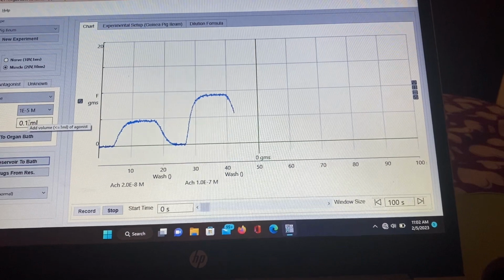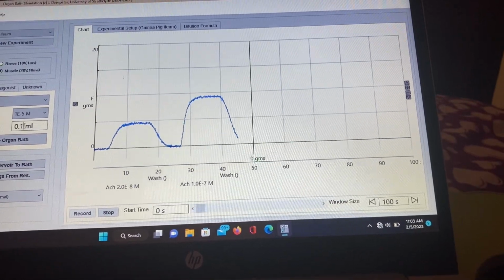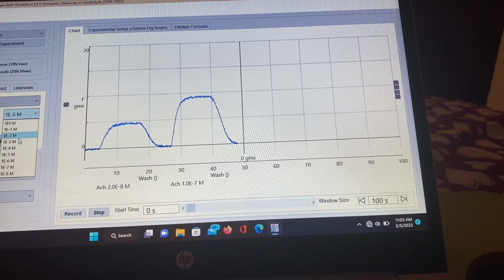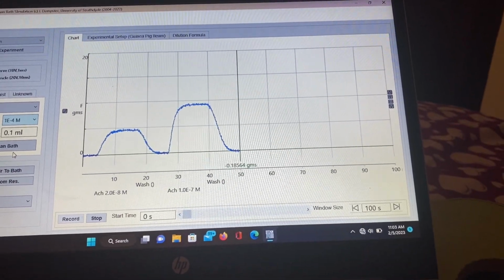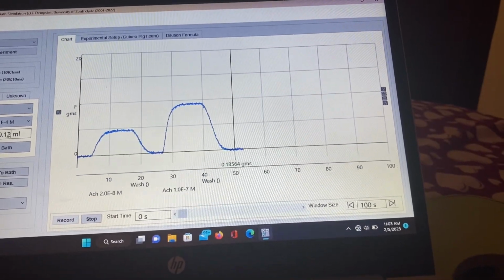So now if you reach a point where, when you are adding your GP factor, you are getting greater than 1. So let's say I multiply now and I was getting, let's say, 1.2, and we don't want 1.2 here. So it means you're going to change this to -4. Because if it was 1.2 and I take the decimal point back, I'm reducing it. So I change to -4 and then now it becomes 0.12 instead of 1.2.